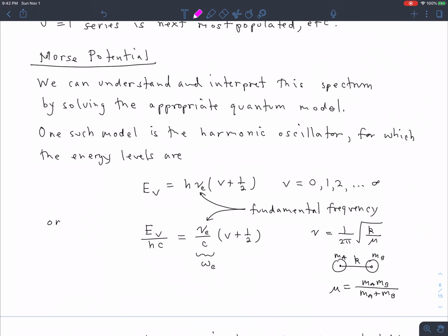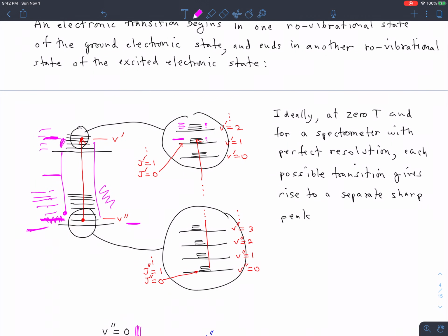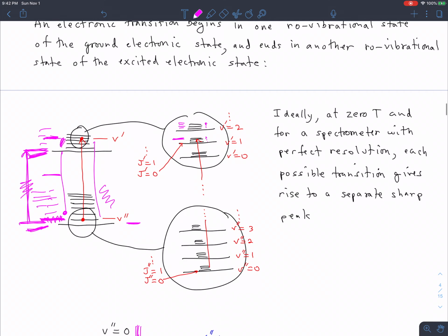There's two possible models you can consider. We're not going to talk about the rotations anymore. We're only going to talk about the vibrations, and we're only going to talk about the first two electronic levels, the ground state and the first excited state, and we're just going to take those as givens. We're not going to make a model for those. There's really only one parameter that describes those. That's the energy gap between them. And we'll get that in the end. But there's not too much to say about that. There's no Hamiltonian or model for that. So it's all going to boil down to the vibrational model.